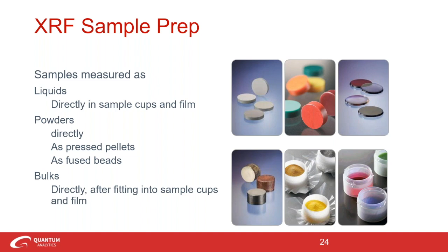And you don't have to spend a lot of money on some of these sample prep techniques, but the more you spend, usually the better they get. But you got to consider some other considerations on, you know, how fast of an analysis do you need, how accurate of an analysis you need, and so on. But I digress here.